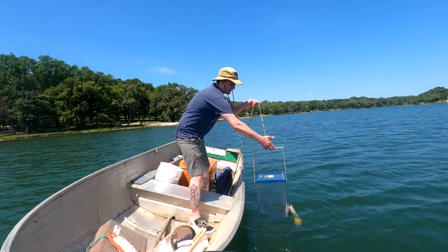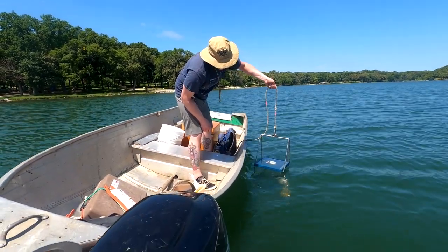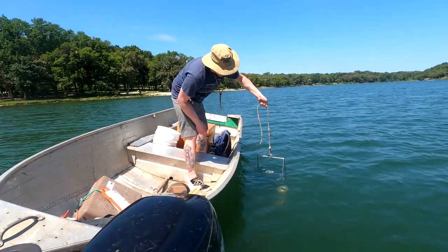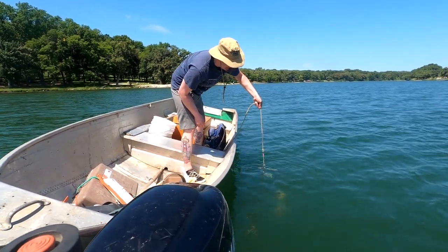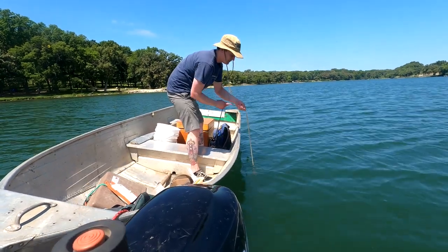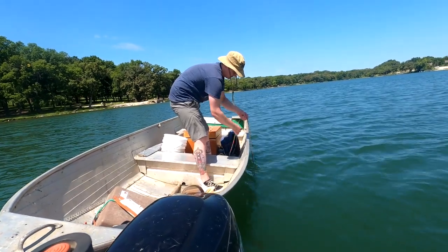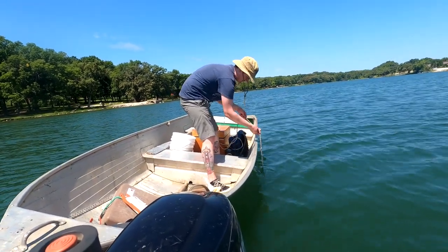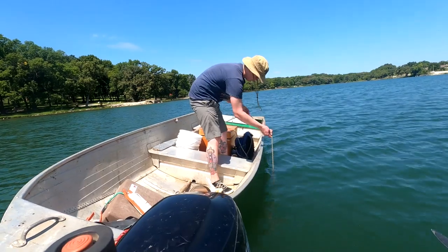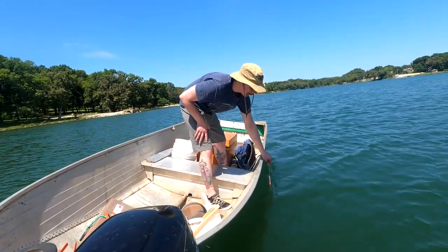So we're going to go ahead and lower it in. Hopefully you can see that door opening up, and that second one a little bit. We're going to lower it down to five meters — there's the five meter mark, so I'll stop.